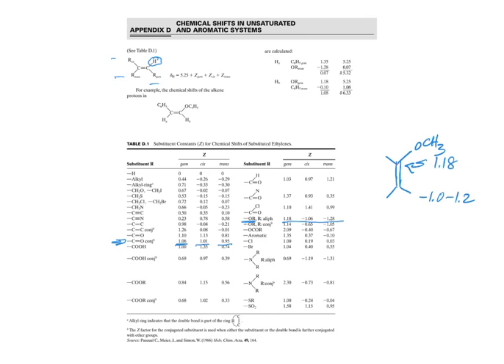Well, kind of. I think for one thing that we can see is that somehow that methoxy group is creating a very polarized bond, right? So it has to be on the carbon here. If this is shifting it downfield, this is going to be de-shielding. And this other end here is going to cause more shielding, at least relative, right?